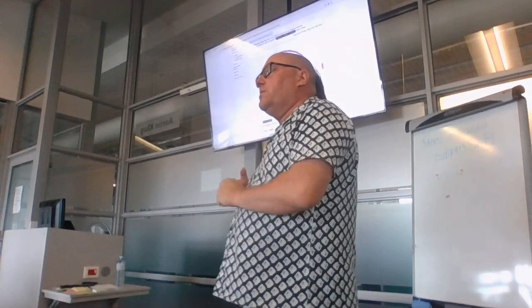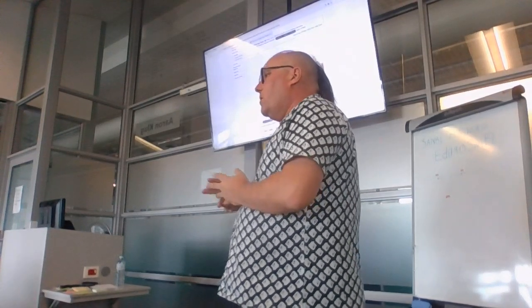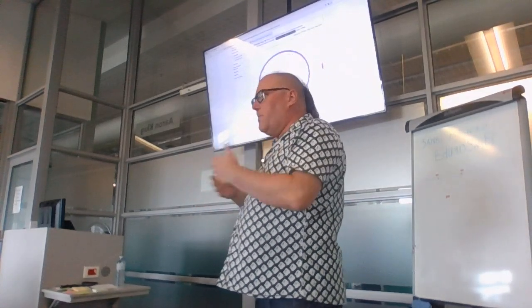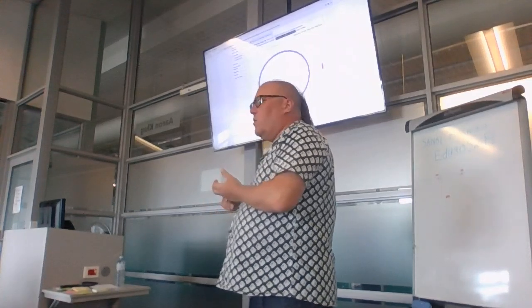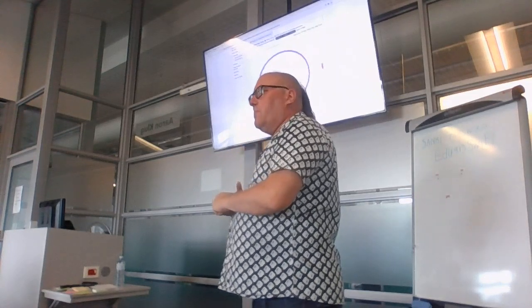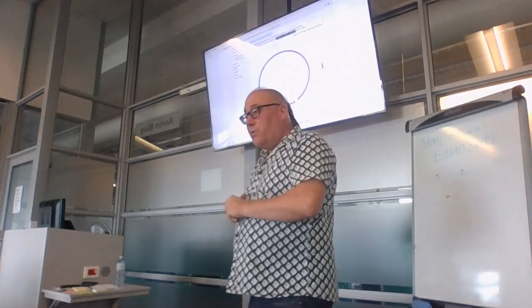The other thing is that the base callers you get have been getting better and better. Dorado, I think, is the latest base caller. Is it Dorado? They're all named after fish. It was Guppy, and then they came out with Bonito, and now there's Dorado. Okay, so now we're on Dorado.